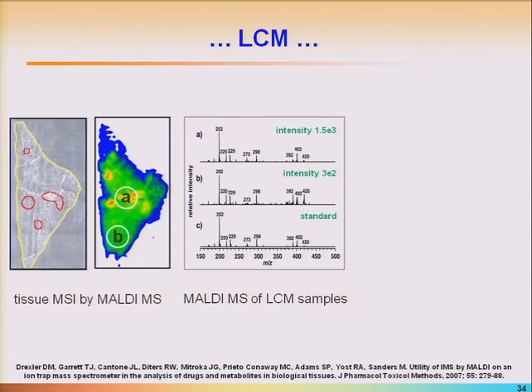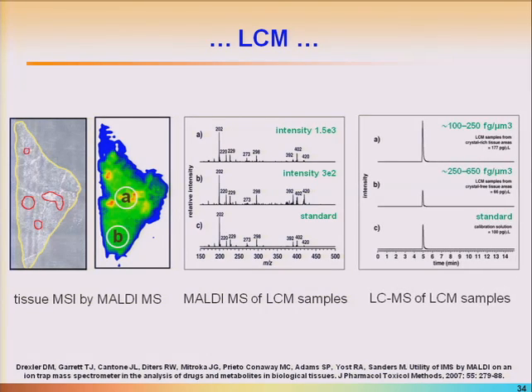So we used up about 1 microliter, and after that we could actually submit it to LCMS. And on top again, this is the LCMS, MSMS trace of an area from here, from A, and B from down here. So we have the high crystalline area and no crystal area. And since it's a high-dose animal, you always will find drugs at these levels. And here's the standard.